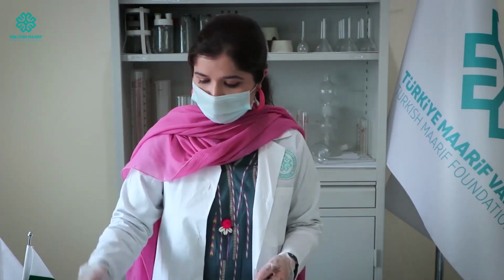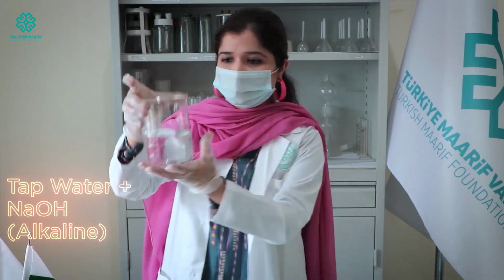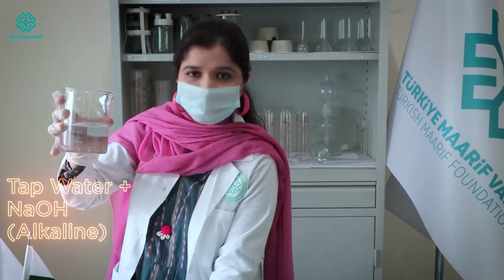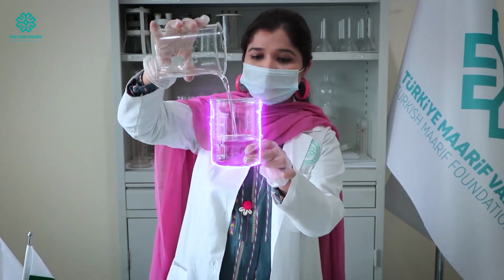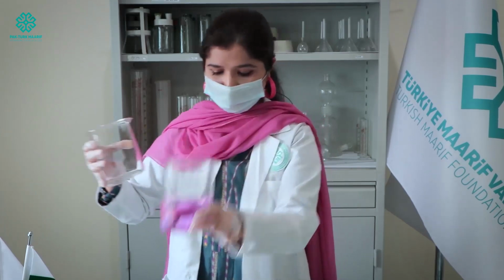Now I am going to transfer this tap water, which is now alkaline in nature, into beaker 2. Wow! From colorless solution to the pink solution.